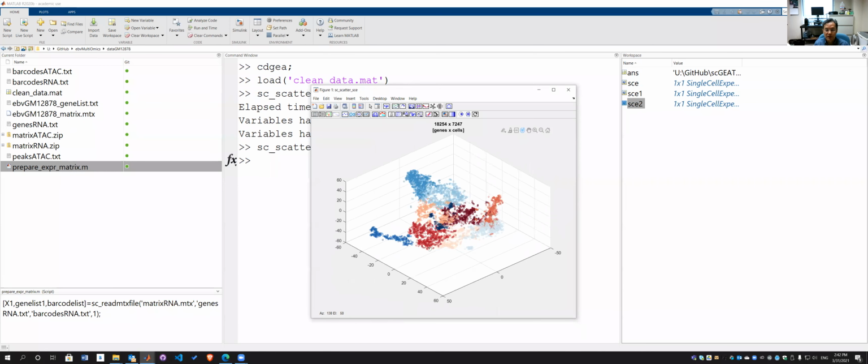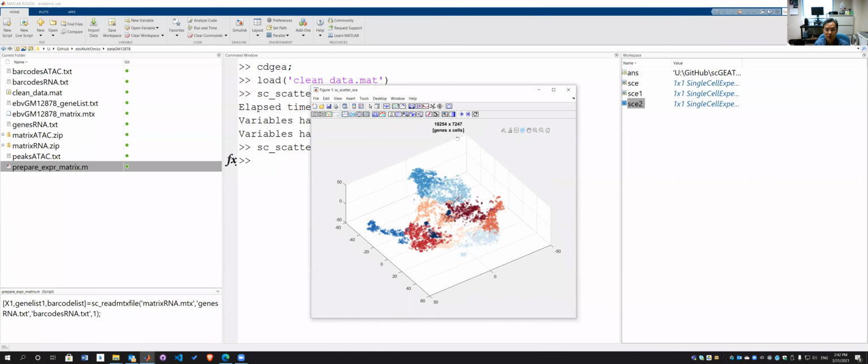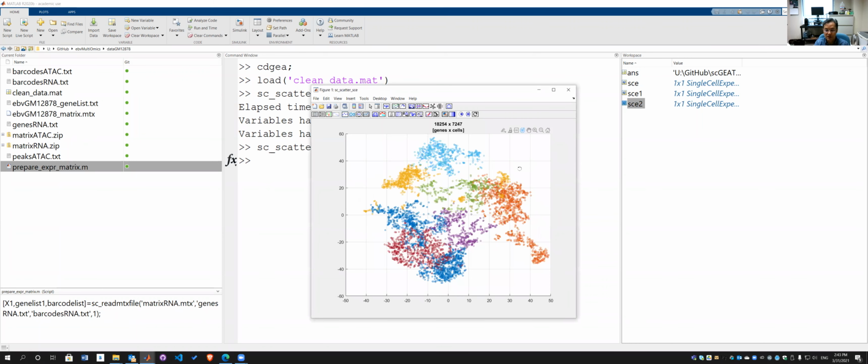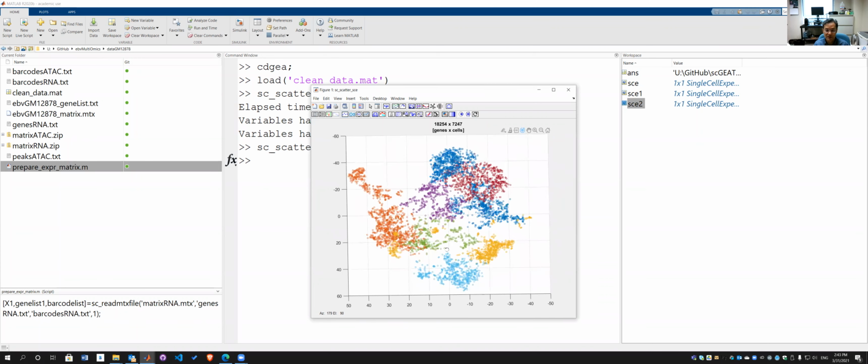Also, in many publications, you may want to use 2D instead of three-dimensional. In that case, you can click this button to switch between the three-dimensional representation and 2D. If I select this, the default view means you will keep the coordinates X, Y, Z as they are. By default there's an x-axis and a y-axis, so by default this is x and y, and you will get this.